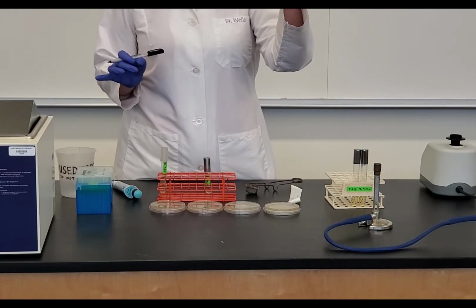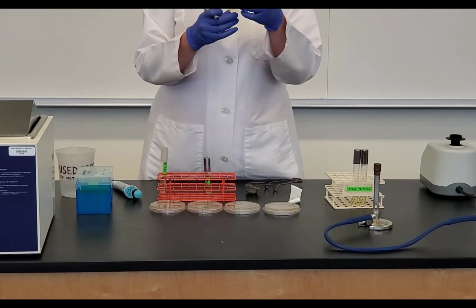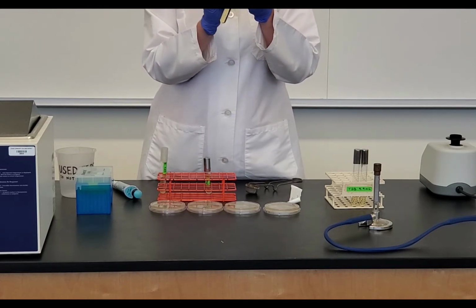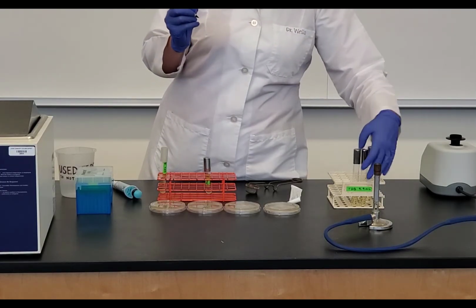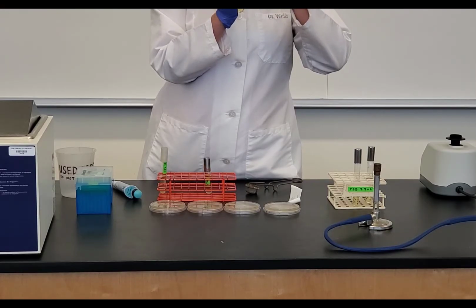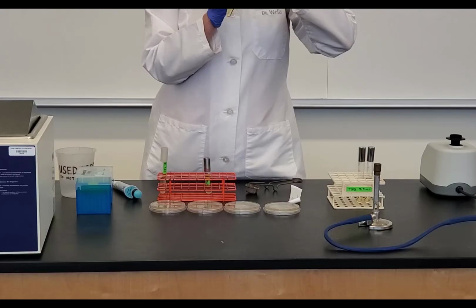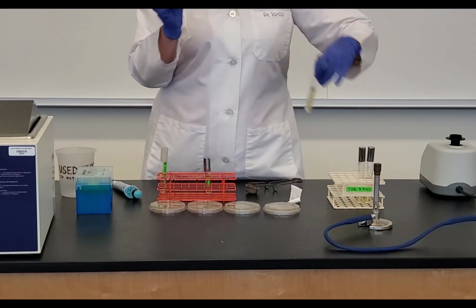I'm also going to label my test tubes that have the tryptic soy broth because this is what I'm going to do my serial dilution. So one of them is going to be labeled 10 to the negative 2. I have my 10 to the negative 4. And I have my 10 to the negative 6.